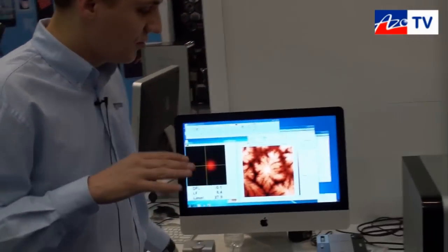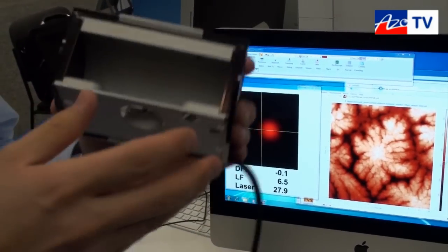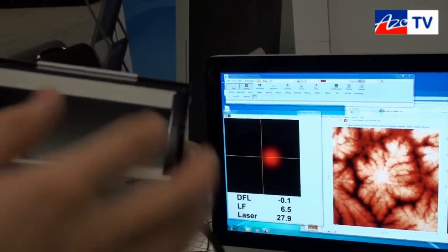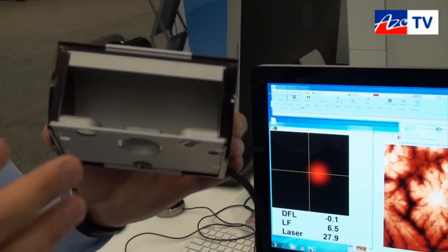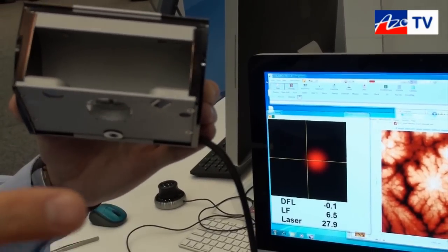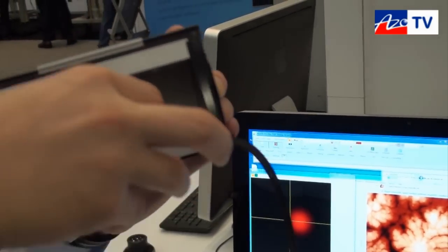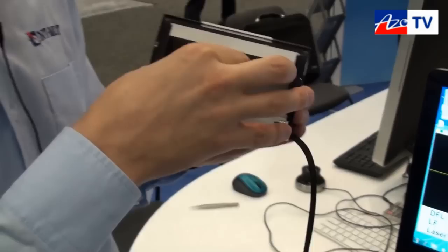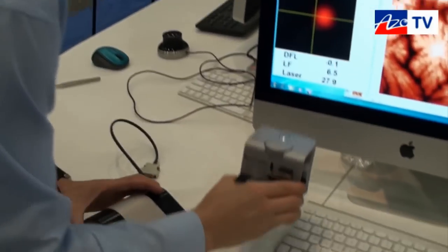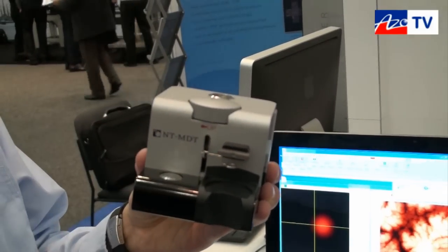Another option is the Solver Nano head for real beginners, like students or even school children. One of the most consumable parts is the probe, which costs several tens of dollars and is easy to break. With this head, you get an easy-to-install probe — you can do it without tweezers. And if the tip is broken, you can put it into a special etching device which etches a tungsten wire and produces a new probe.